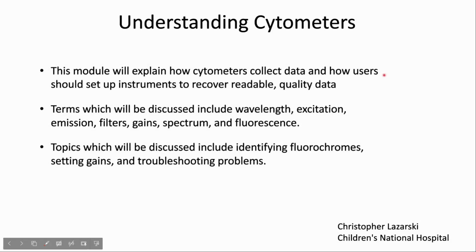This module is an introduction to some of the basics of flow cytometry instruments. My name is Christopher Lazarski, and I am the Flow Core Director at Children's National Hospital. This module will help explain how cytometers collect data and how users should set up their instruments in order to recover readable quality data, which they can then use for publication.